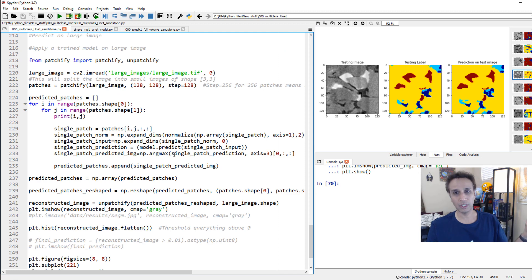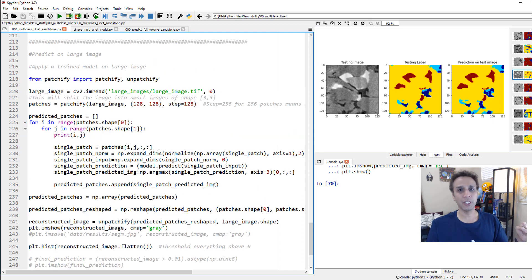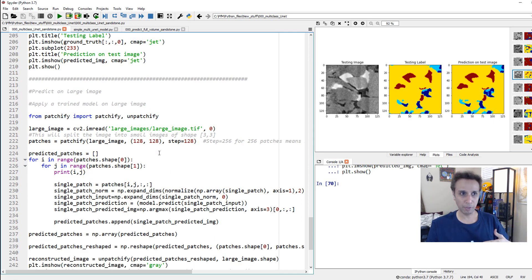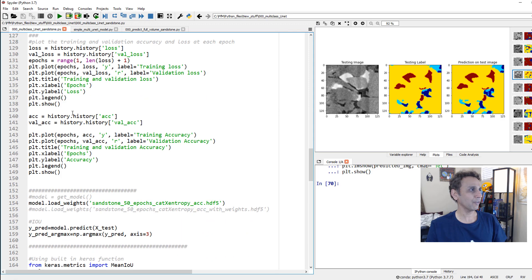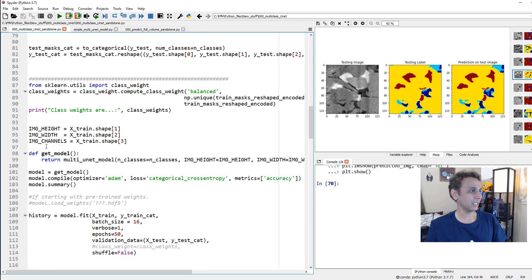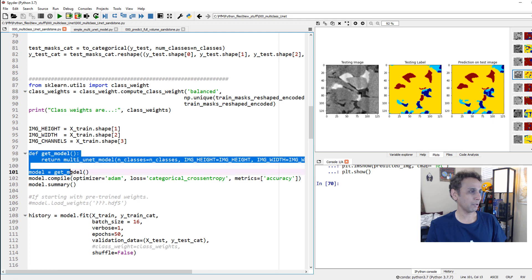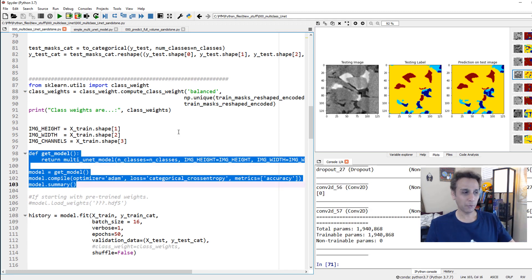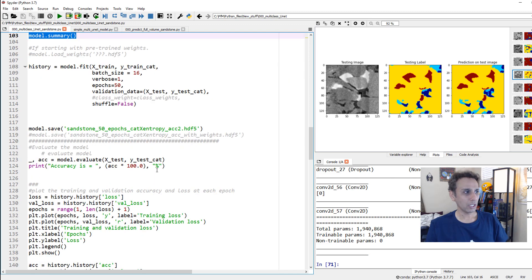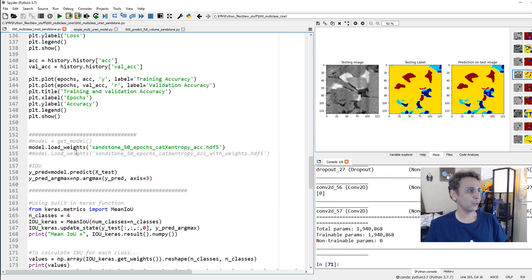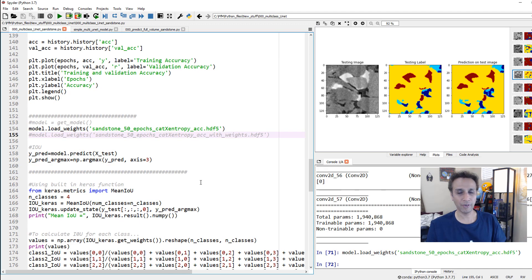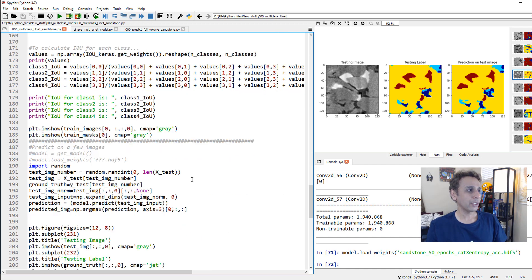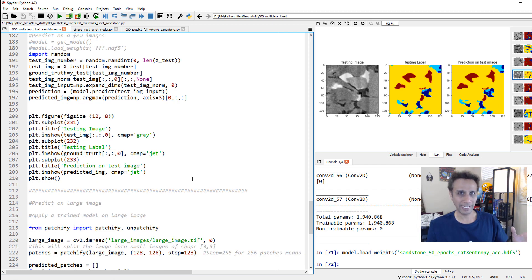Typically, once you're done with training, you have a trained model. The next step is to load it. So let's assume we don't have anything loaded - first I would get the model, compile it, and once loaded, I then need to load the weights. So I've loaded the weights and I'm all ready to go.